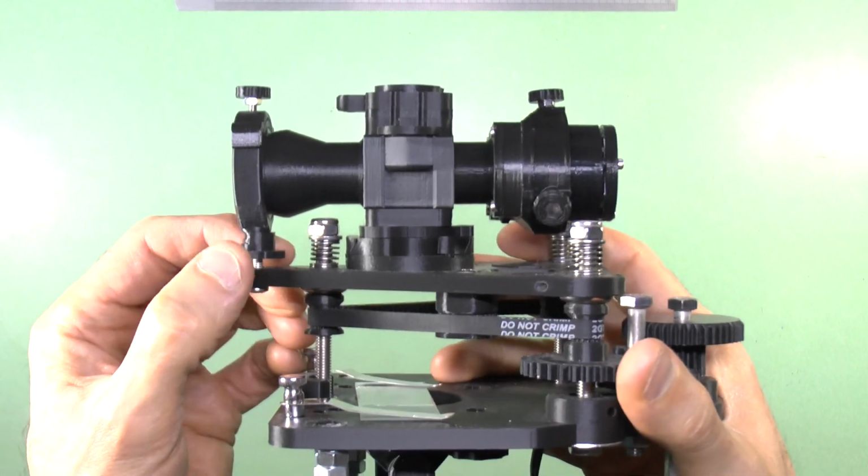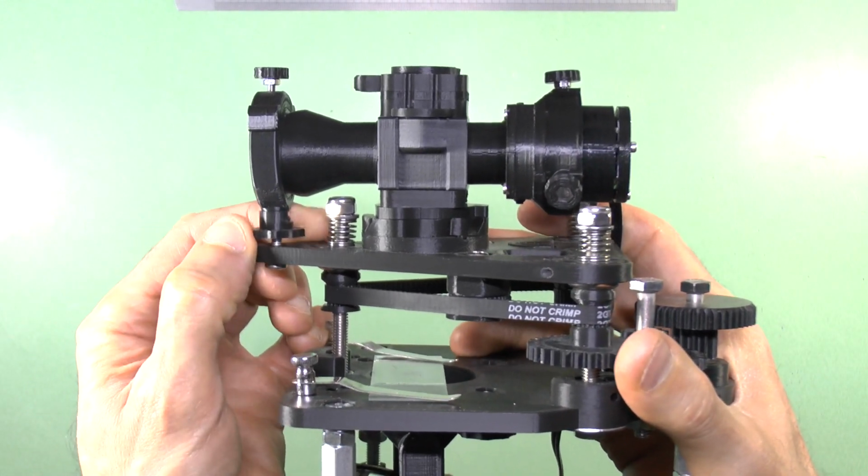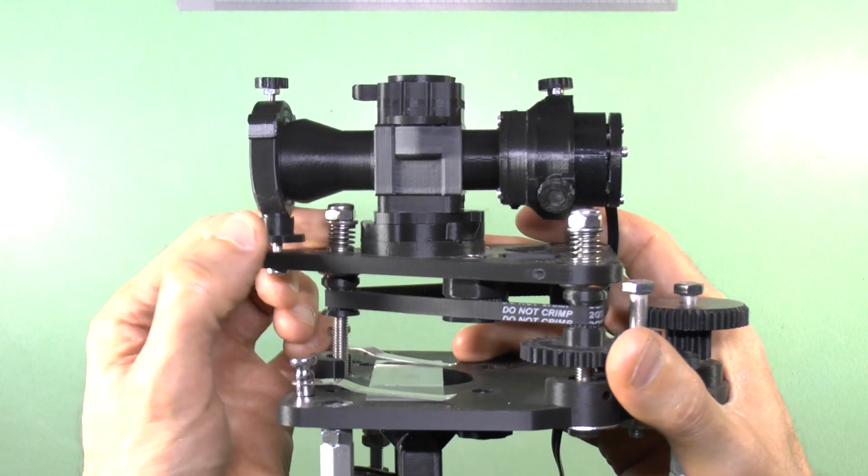You can adjust the tilt of the optical tube backwards or forwards slightly by adjusting the stay thumb wheel.